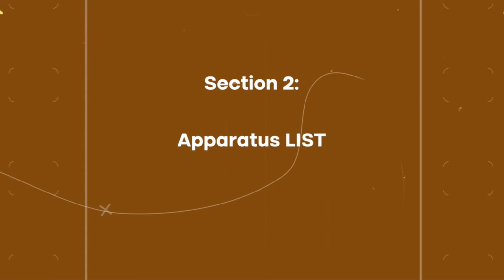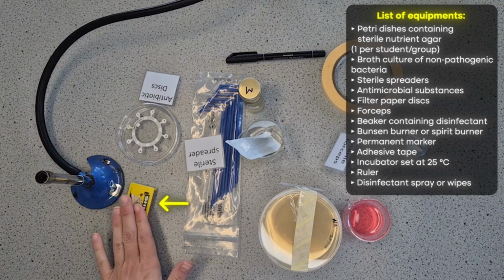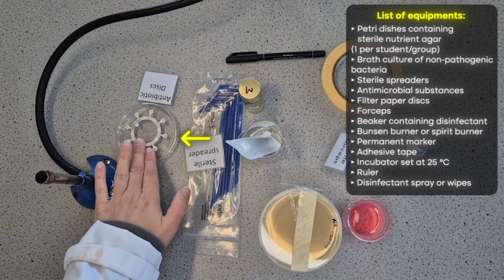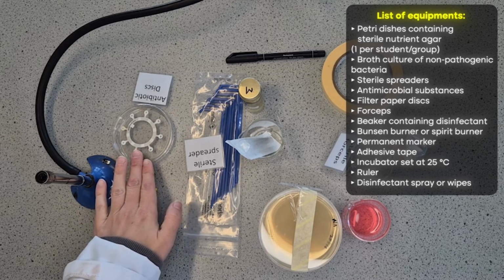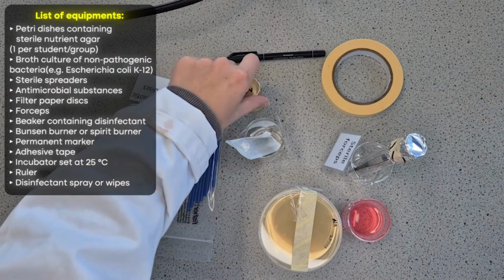In this experiment, we're going to need a Bunsen burner to help keep our aseptic conditions. You're going to need matches to light the Bunsen burner. The antibiotics that you're going to be using to test with. I've got sterile spreaders here, pre-sterilized. I've then got my E.